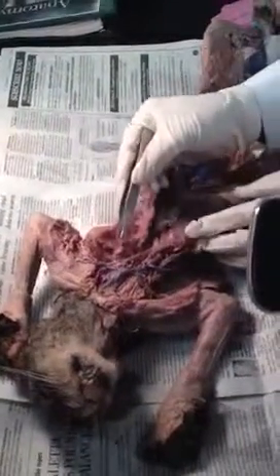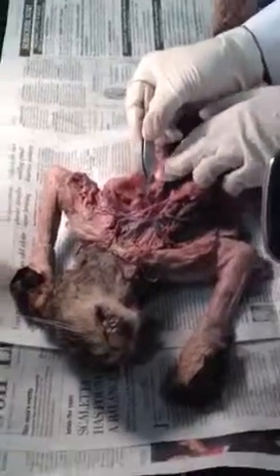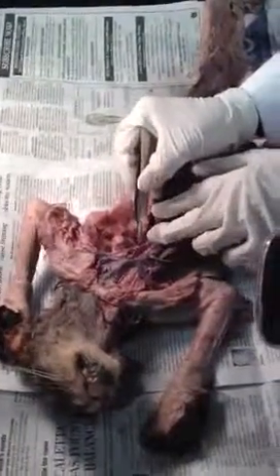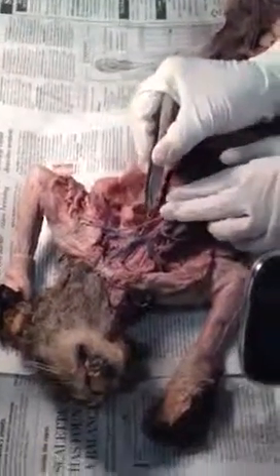Okay. Then let's look at the finer branches. So from the subclavian, you should have one internal mammary that should be going here. I don't know if it's cut off. How many branches do we have from the subclavian? You have internal mammary, vertebral.